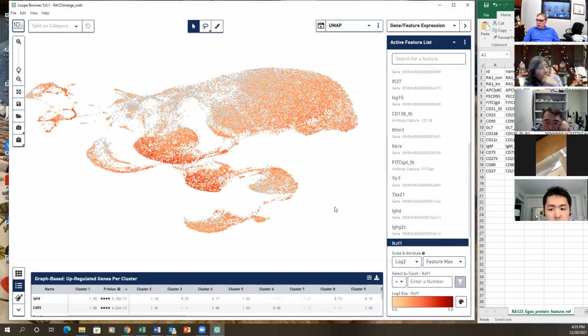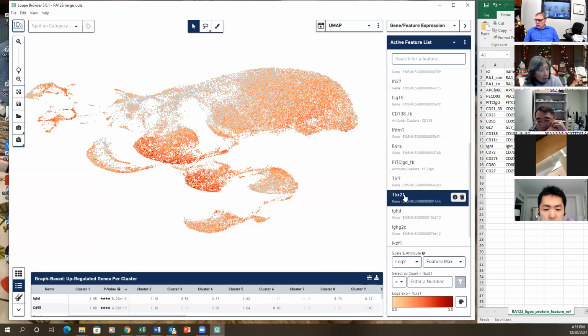Now, let me get one thing straight. There's DN2, that little bleb down there. Right here. Now, these two are germinal center, also this T-bet, which we know is up as a result of interferon gamma in germinal center. And there are two populations. How can there be two? There is that population down there, and then that population way down there. Is that not non-specific, right?